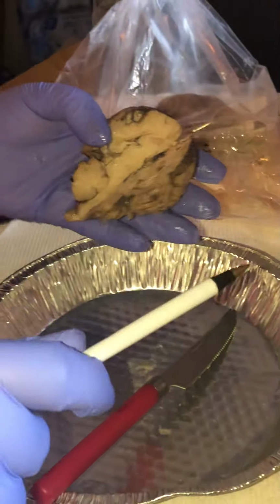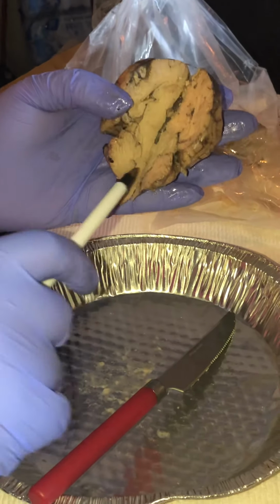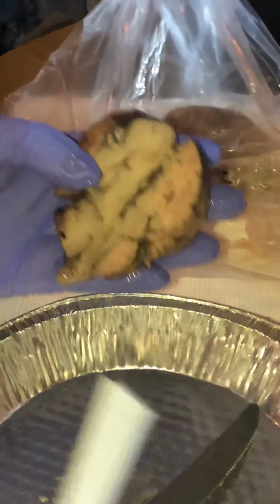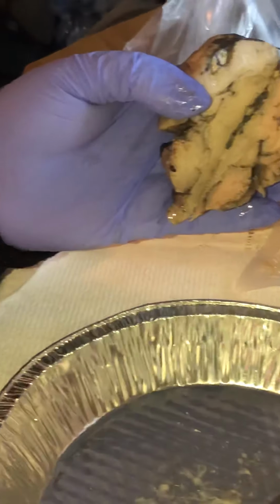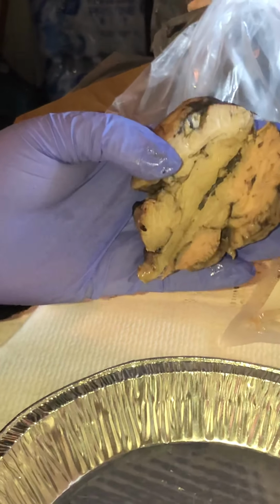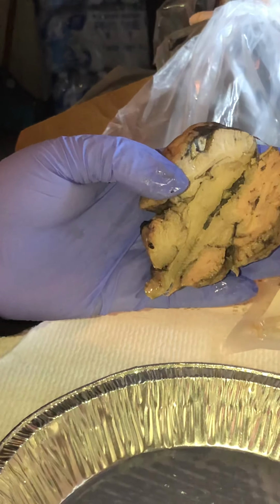Okay, so let's go right here to the cerebellum, this large part right here. And the cerebellum is our little brain, as you call it, which is for balance and coordination.